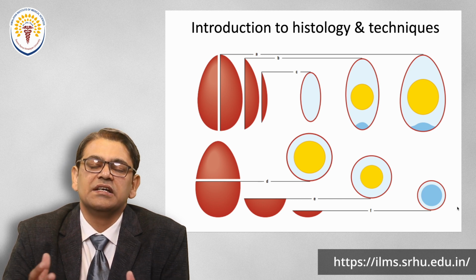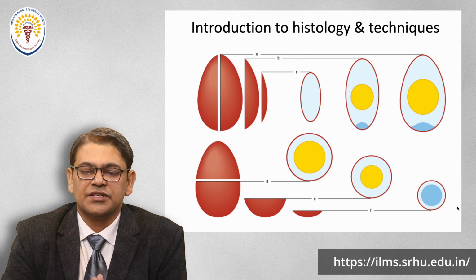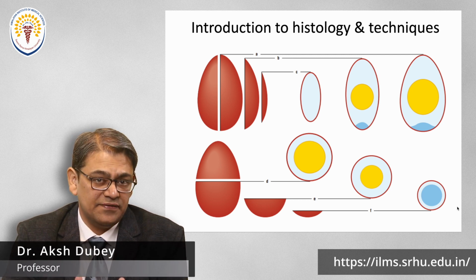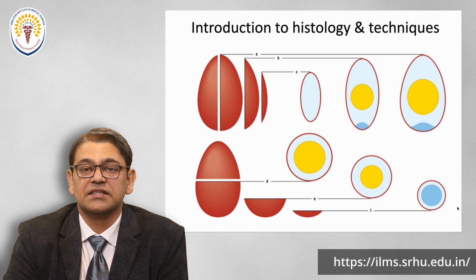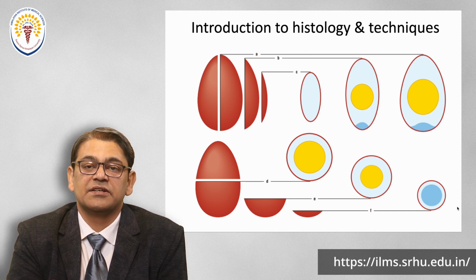As you practice more and more with histology slides, you clearly get an idea of how the cells are arranged in a particular tissue. So understanding of this plane in histology is the key feature. It also depends on how you are placing the tissue in these sections. Suppose you obliquely place the tissue and take the section, everything would be changed.